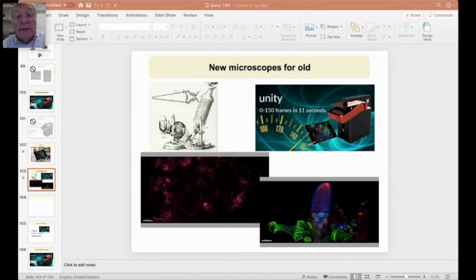I don't know. I think it was a very good technique. For people who don't know, it's the optical version of the electron microscope EBIC technique, where you scan an optical beam across a semiconductor, generates electron hole pairs which can probe various properties of the device. And in a way, it's superior to the electron beam because there's no electron beam damage.